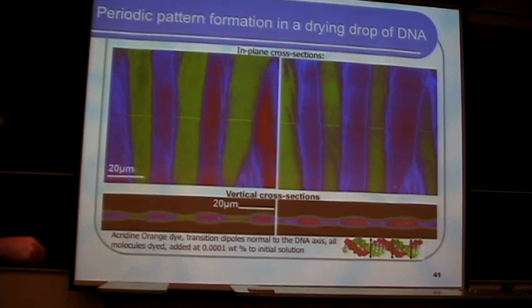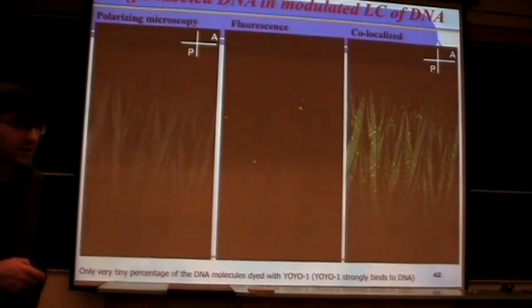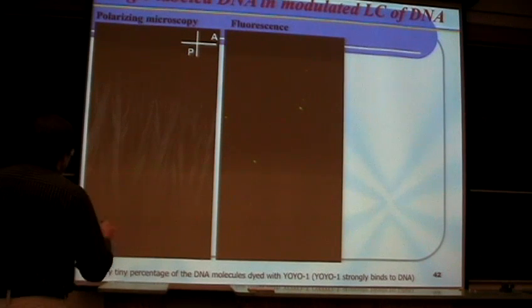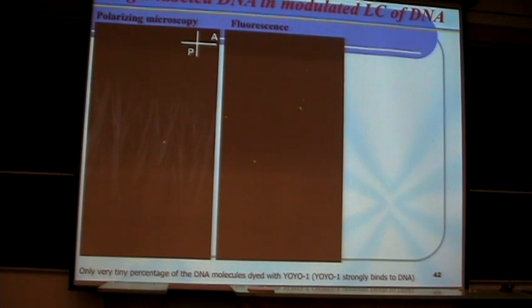You can see from those images that the intensity patterns are complementary with respect to each other, and the color intensity scale that we use in here is similar to the one I showed before. This does make sense, telling us that we are able to visualize the patterns of molecular orientation using this technique in lyotropic liquid crystals of DNA as well.